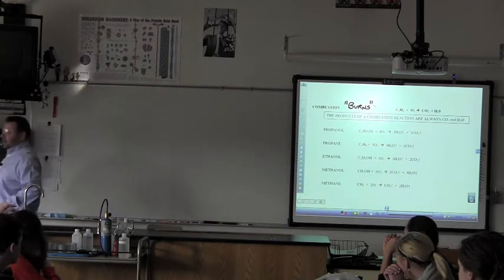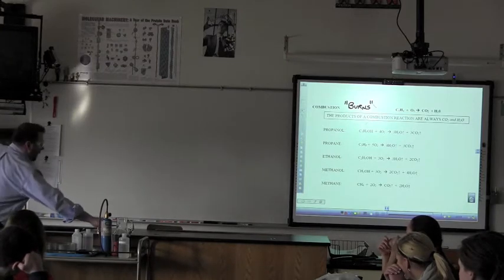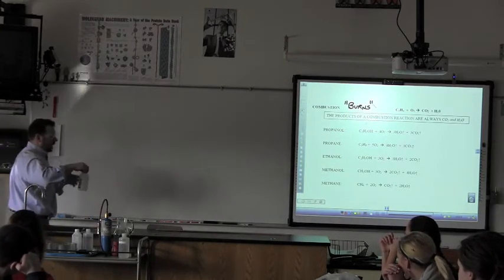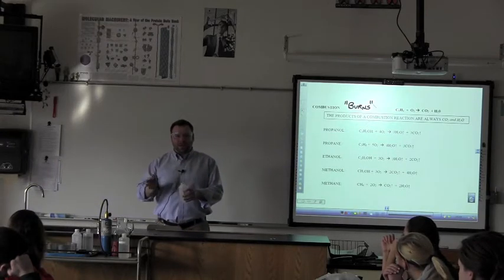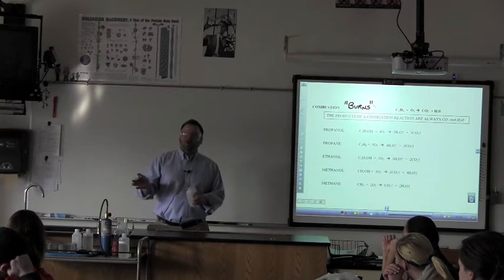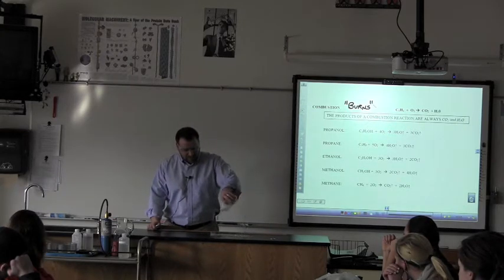Okay, so we're going to start off with propanol. And propanol, first of all, you probably recognize it more as isopropyl alcohol, and it is a type of propanol. Iso is just a way that we identify an organic molecule. We're not going to worry about that, but we're simply just going to experience it.